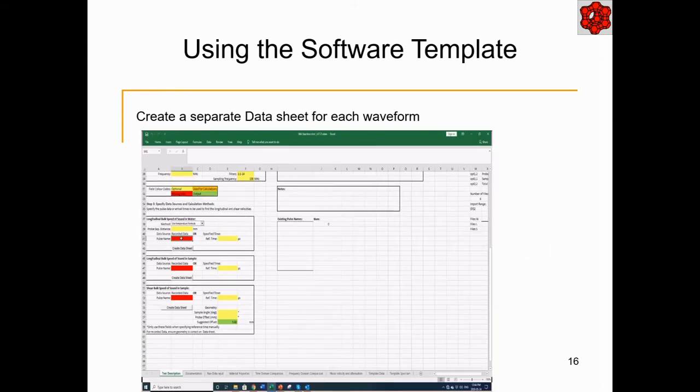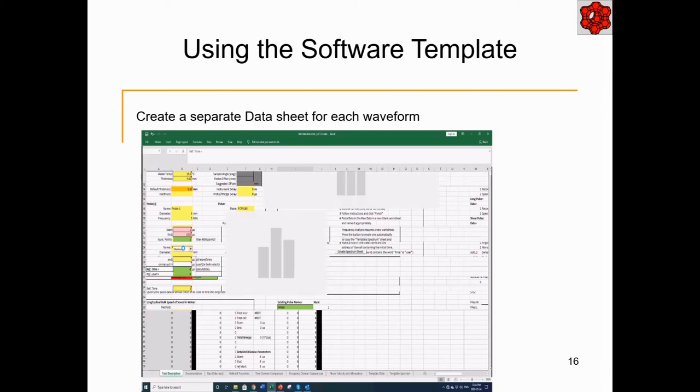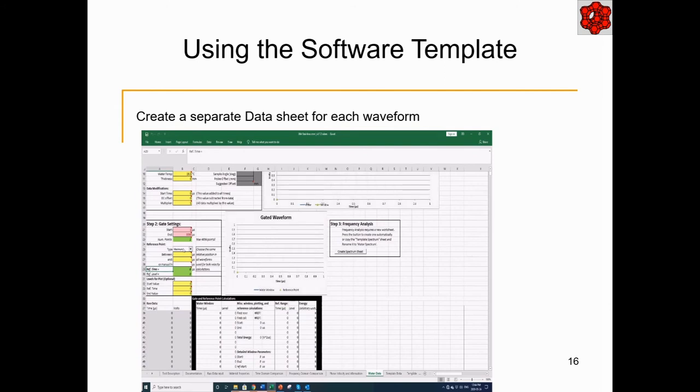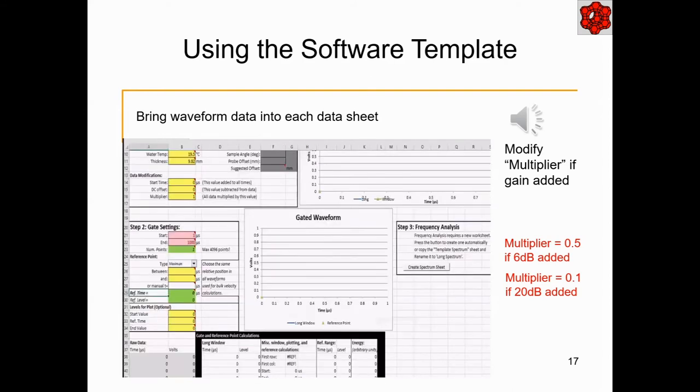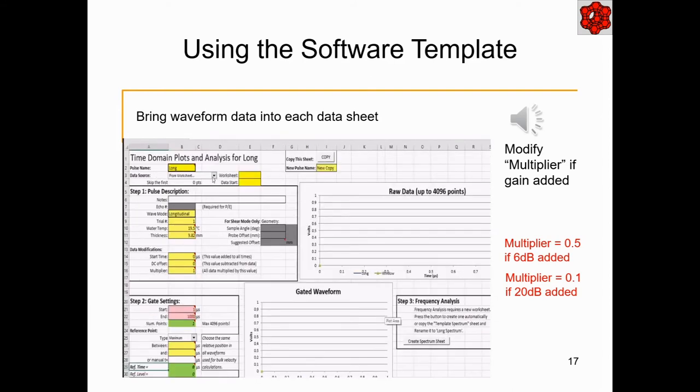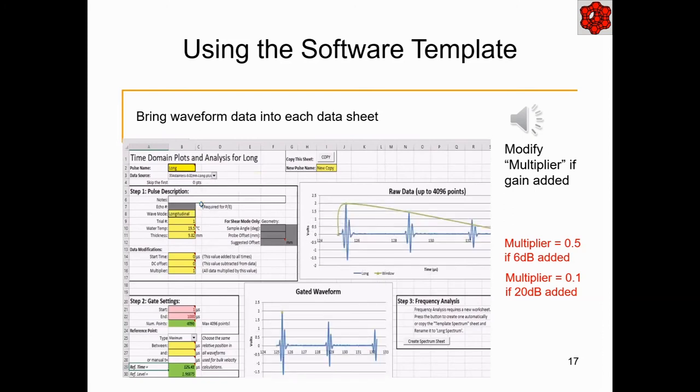On the same Test Description worksheet, we now import the TXT files. There is a separate process for CSV file format. Next, we make analysis pages for each waveform. Once you have entered a name for the data in the red cells, there is a prompt that a datasheet needs to be made. Clicking on Create Data Sheet automatically generates the worksheet and gives it the name that you entered in the red cell, for example, Water Data. Once you have created the data sheets for each of the modes, go to the datasheet one at a time and import A-scan data files. Make sure you import the correct file name and do not mix up the water, long, or shear files. Having selected the TXT file name that you want to see, the waveform is displayed.